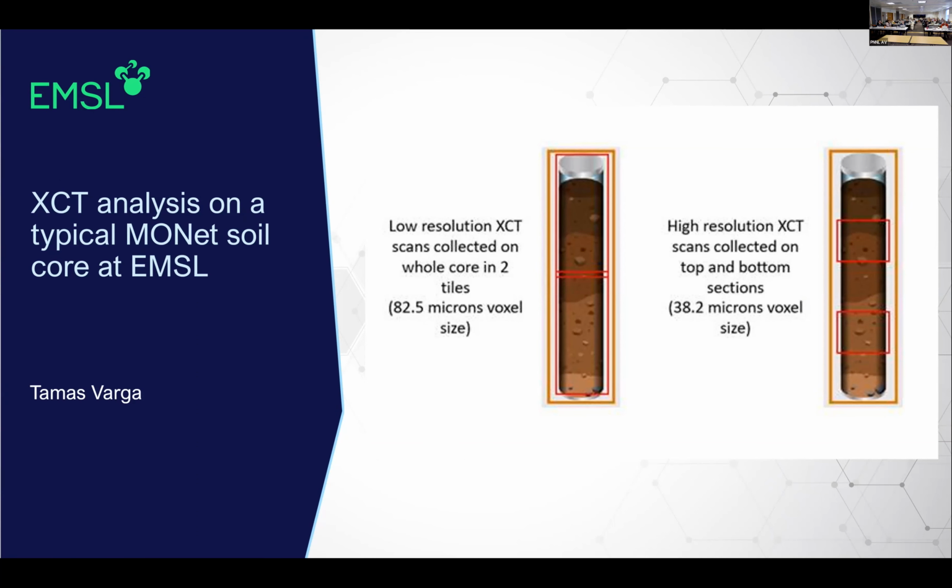If it's really similar in density, then we might include not just pore space in that segmentation. We know that from better data sets, when we do a micro CT scan on an aggregate, an 8 hour long scan, which is all the time we spend on these 4 scans, then we get a much better signal to noise ratio, and we see water in the pores, and the organics stand out better.